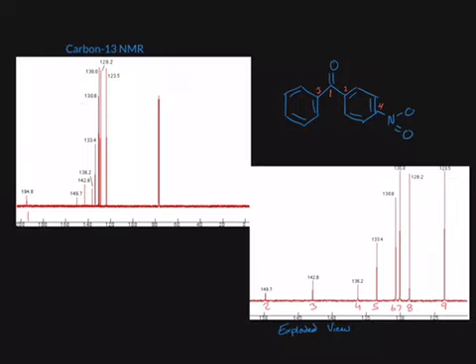And from here we're going to start off with groups, because we know that we have more than just 9 carbon atoms in our molecule. We have 13, so multiple carbons are going to be in the same group. So from here we have 5 and 5, 6 and 6. See how we're moving away from the electronegative atoms. 7, 7, 8 and 8, and our last group and last carbon is a single, and it is 9.